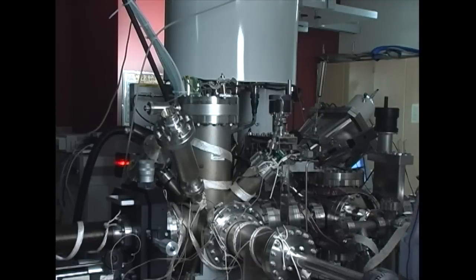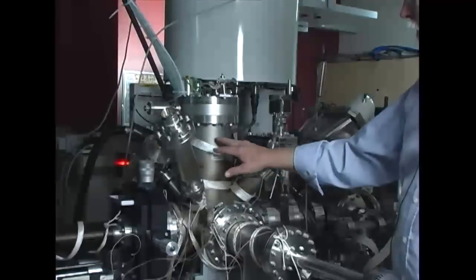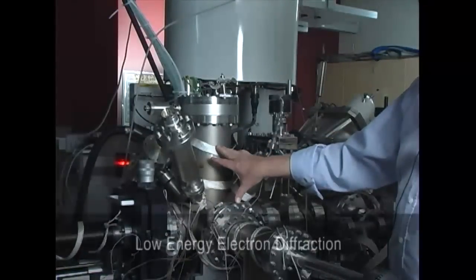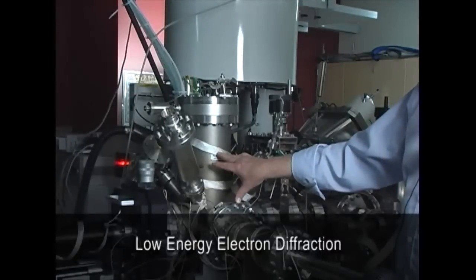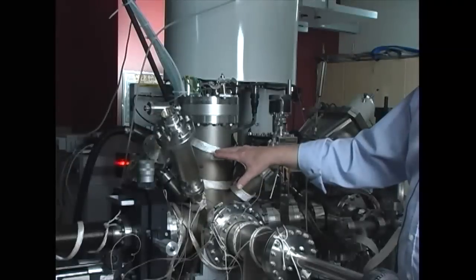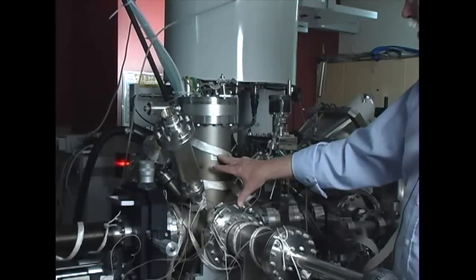Okay, occasionally we want to characterize the interfaces between organic thin films and single crystal substrates. This part of the overall surface analysis system is devoted to what's called low energy electron diffraction, which is a technique that we use to first of all verify that we have a single crystal substrate, and then to probe the molecular architecture of an organic film that's been deposited over the top of that single crystal.